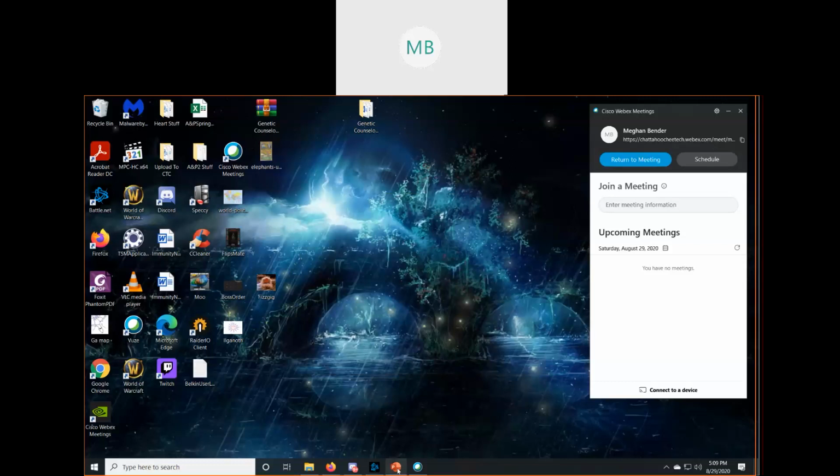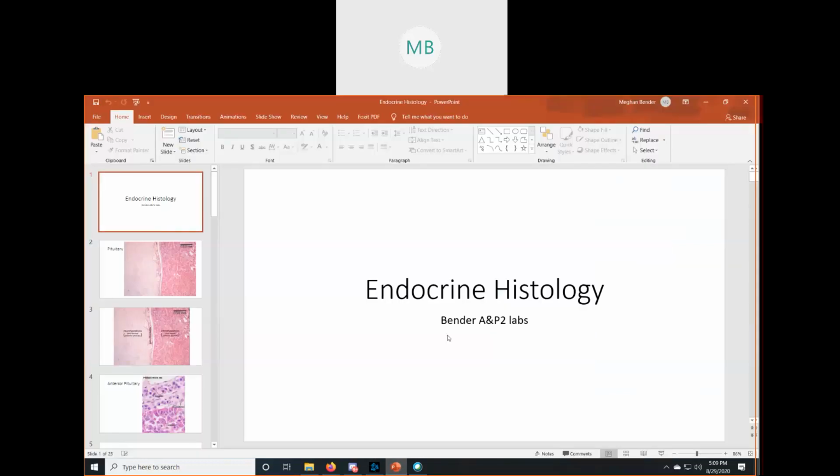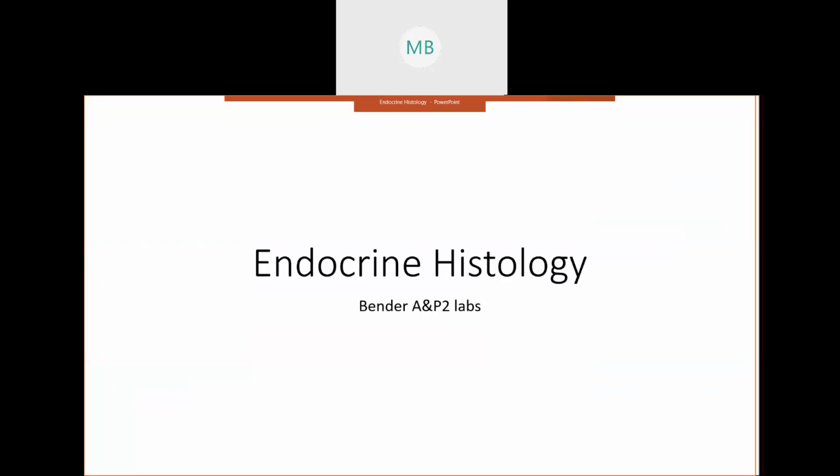Hello, ladies and gentlemen. We are going over your endocrine histology today. This video, bear in mind, we're going to be looking at microscope slides, the microscope slides you can see on your midterms.